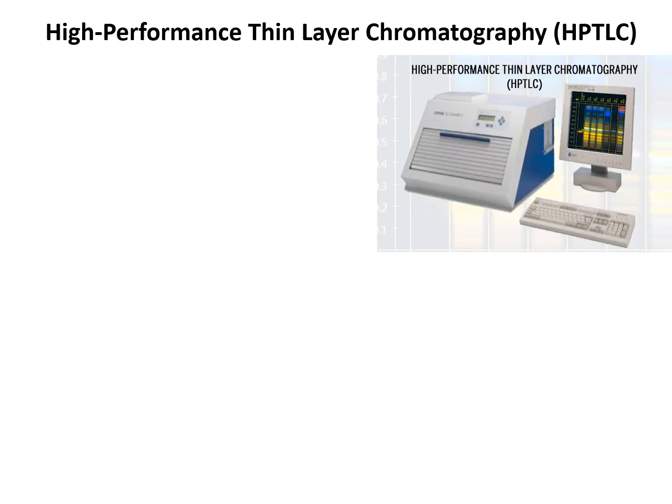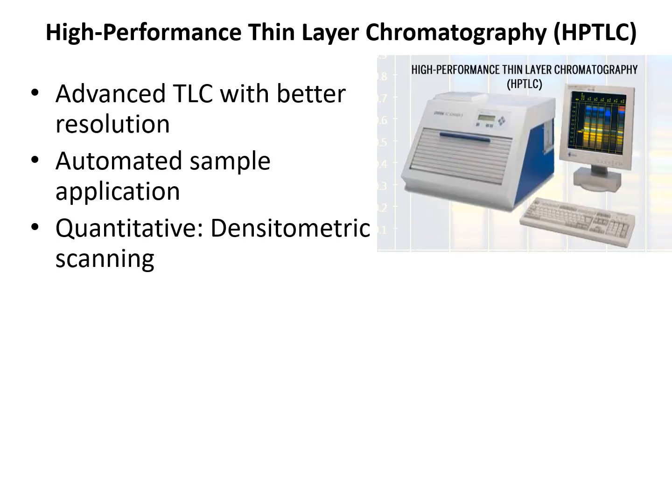Hence, it has the following features. It has better resolution. It has an automated sample applicator. Samples are applied automatically on the TLC plate and then developed.